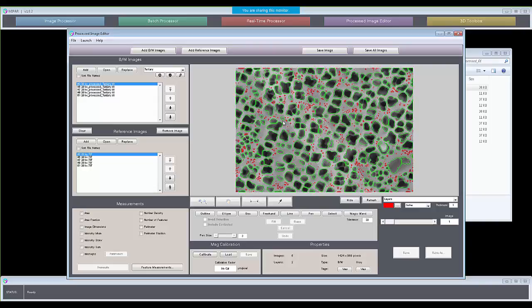I'm not going to spend really much time on manual editing. Hopefully it's not necessary, but it's there if it is. Sometimes it's easier to just, instead of spending more time than you have to make a fully automated recipe, if there's just a couple of mistakes that you want to fix, like let's say you didn't want these features in here.